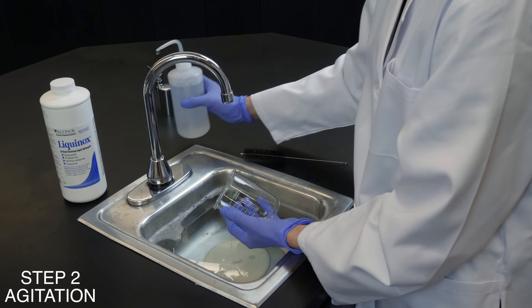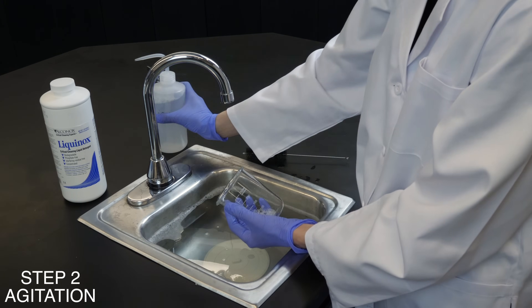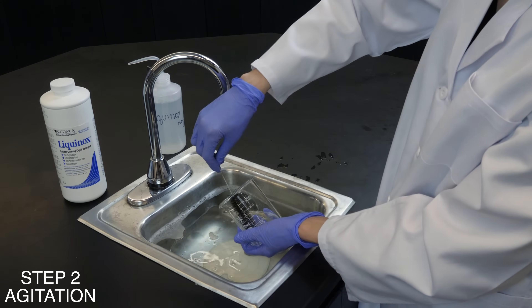When cleaning, agitation is important — the more agitation, the better. This applies to scrubbing, ultrasonic, spraying, and flowing. Soaking can handle simple cleaning.